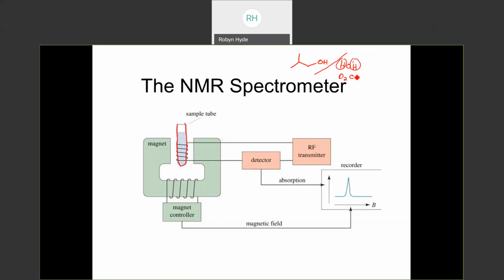And then here comes the significant expense of NMR. We've had our NMR for years, I think almost 12 years. It has never needed repair. We've done some cleaning, but it has never needed repair. But running NMR is expensive, and that is because these deuterated solvents are quite expensive. Instead of using deuterated water, what we use is CDCl3.